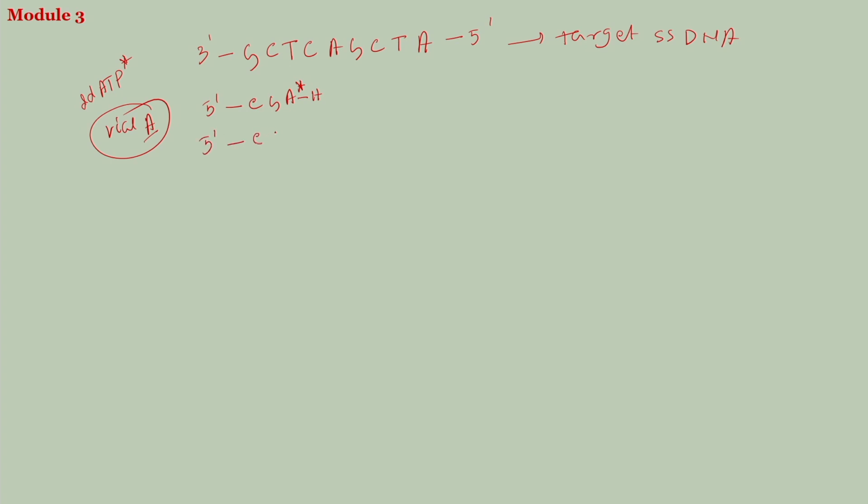Second is C G A G T C G A, it will stop here. So, 2 fragments.